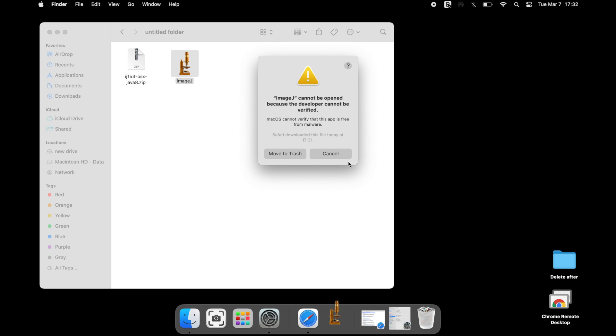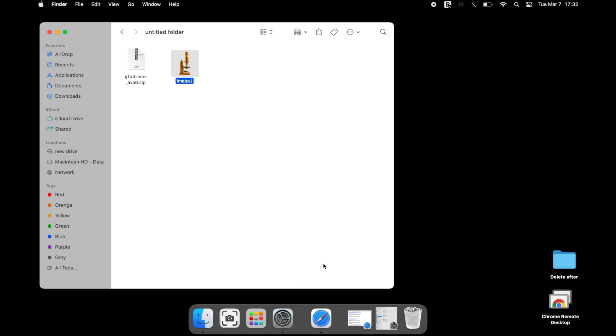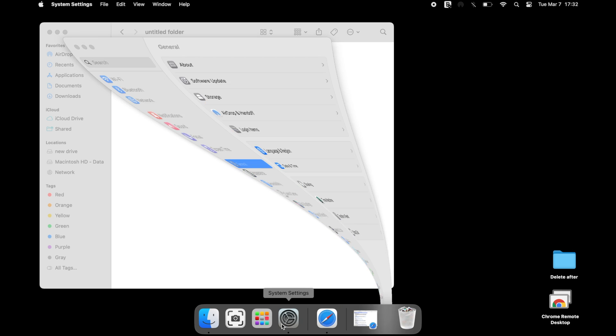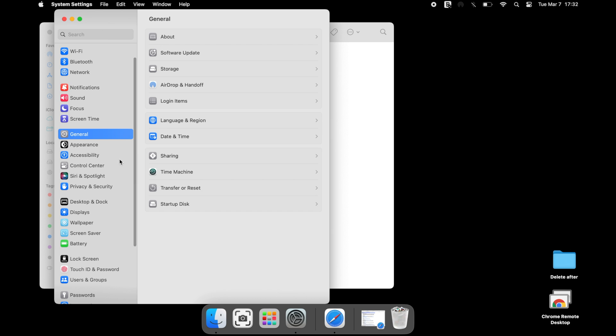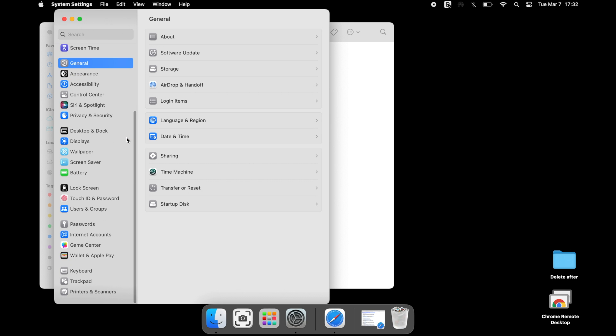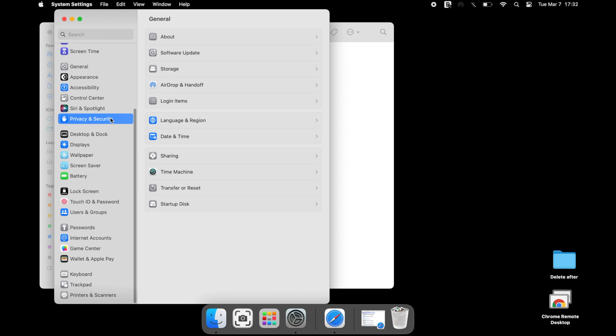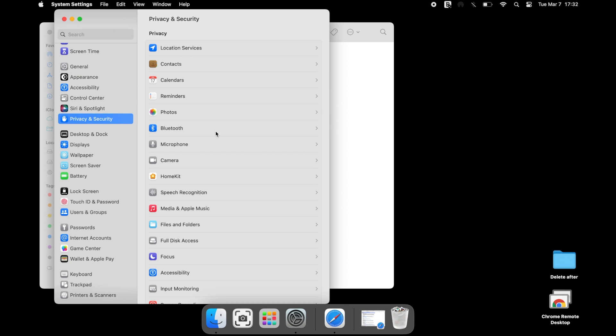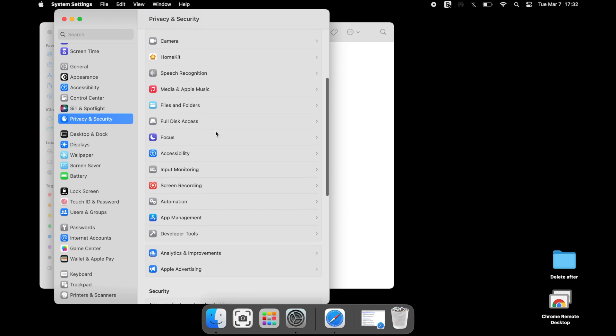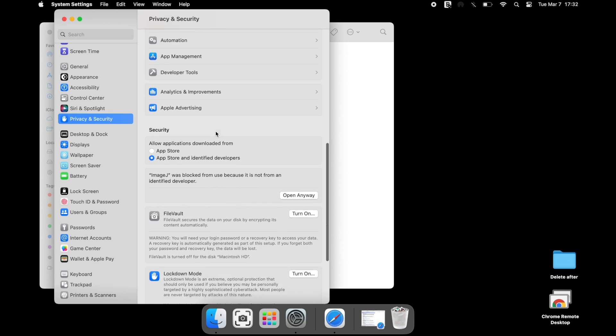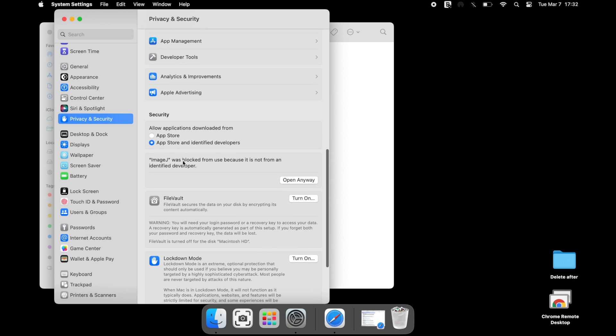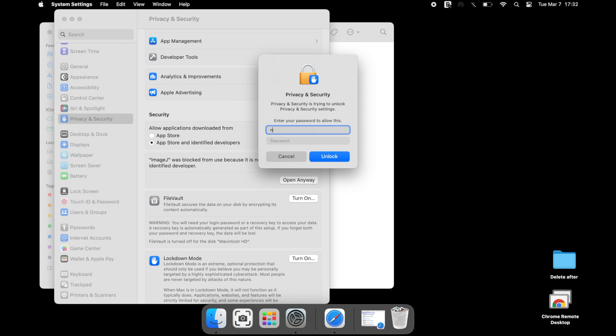Head to the system settings on your computer and scroll down to privacy and security. Under privacy and security, locate and find the message that displays ImageJ was blocked from use because it is not from an identified developer. Select open anyway.